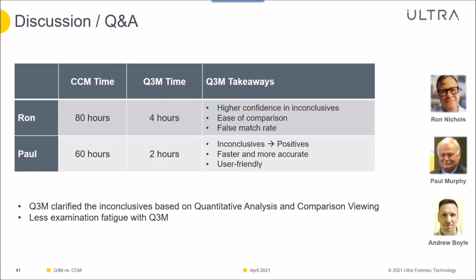Regarding internal validation of 3D microscopy within casework, would this include a user acquiring the images or the examiner performing conclusions with the quantum 3D microscope, or both? The answer is yes. It would be both. We have to deal with the acquisition as well, so that has to undergo a validation as well. And at the same time, the quantum 3D microscope is calibrated, and so it measures that.